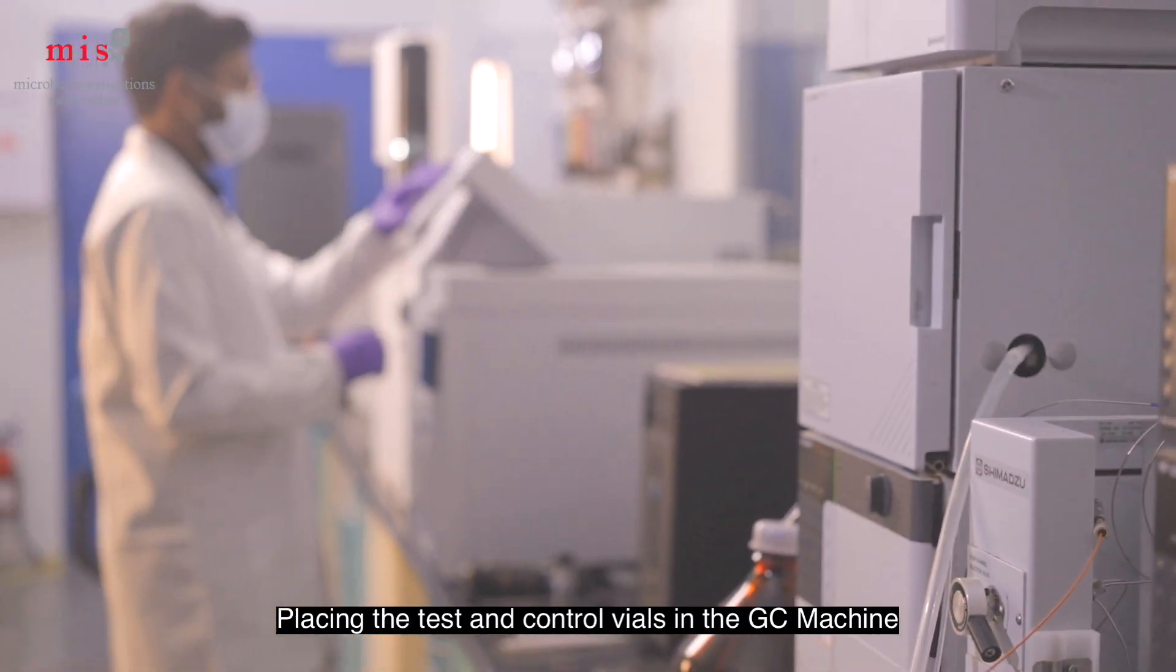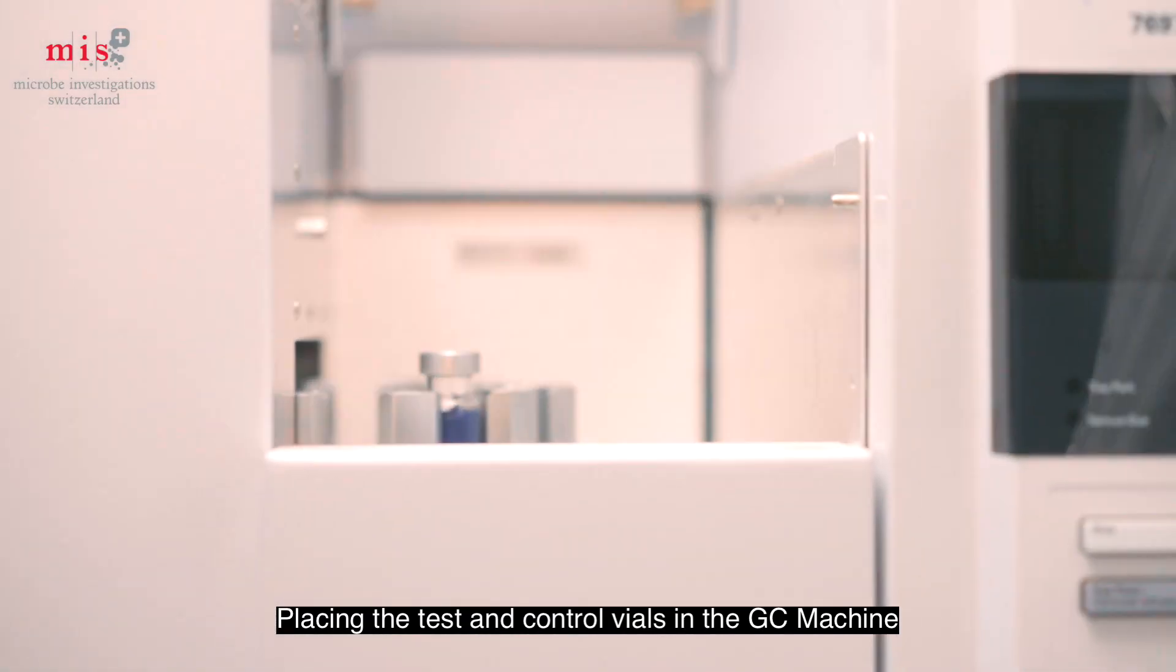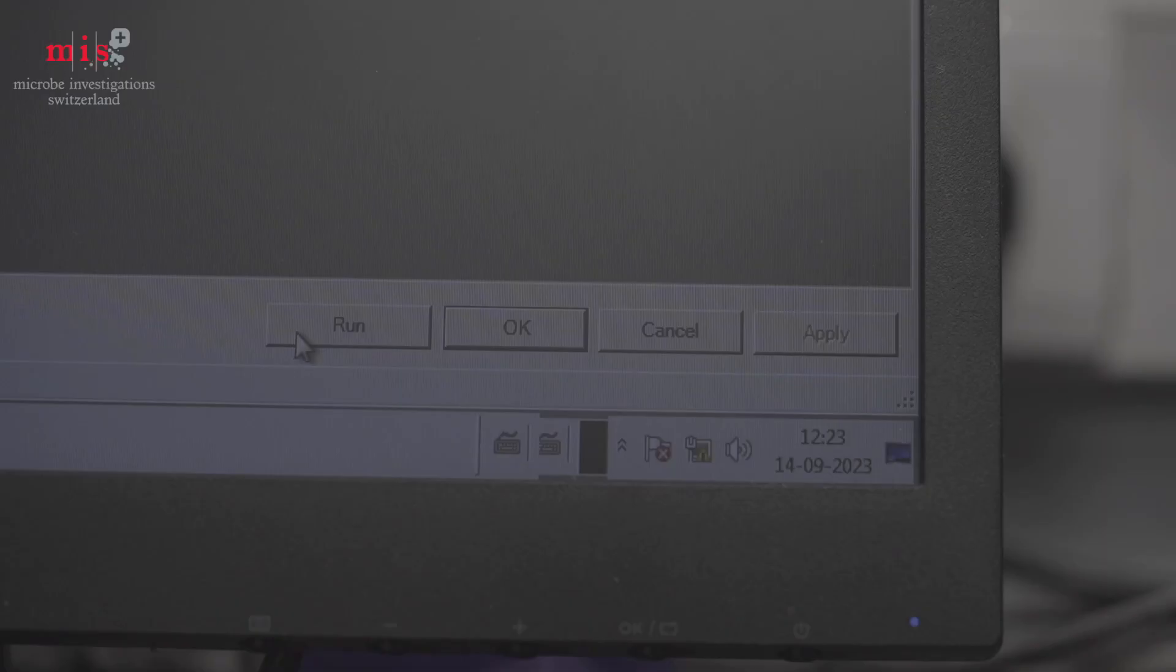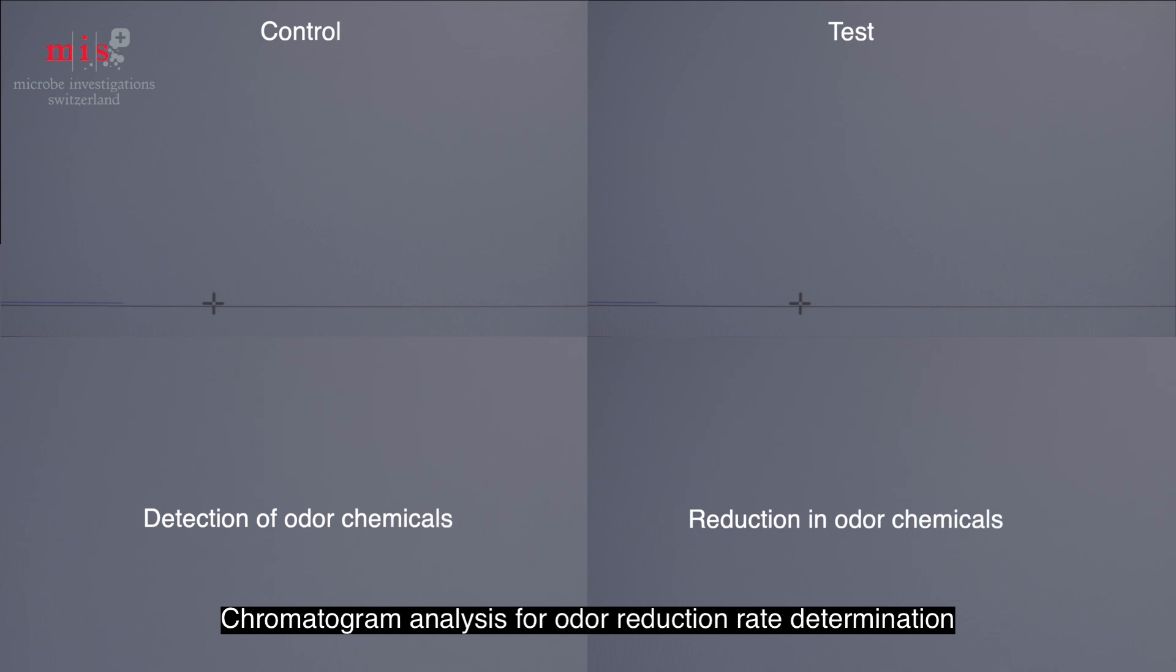Then, the vials are transferred and exposed to a high temperature in the column of a gas chromatography machine. Odor reduction rate is determined by analyzing the chromatograms of the released gases from control and test vials.